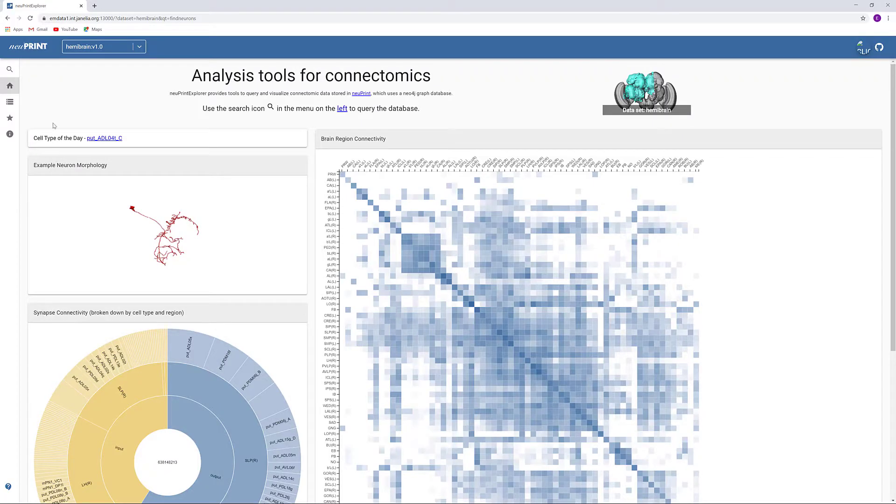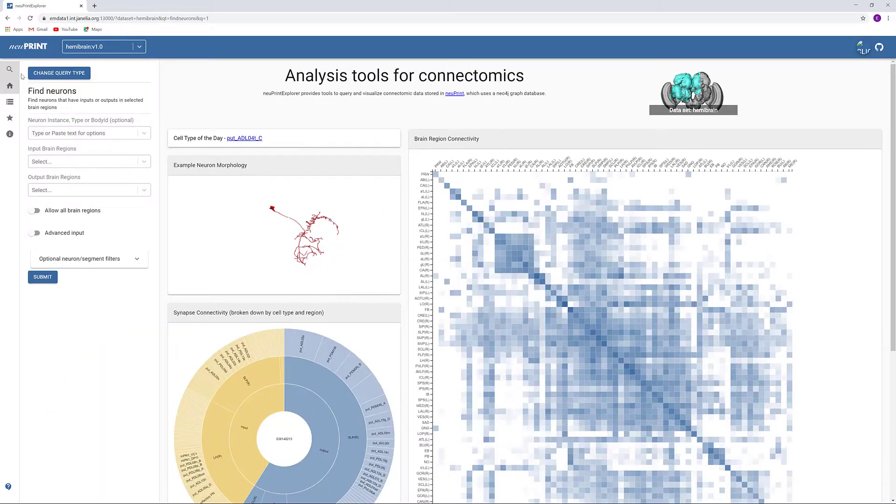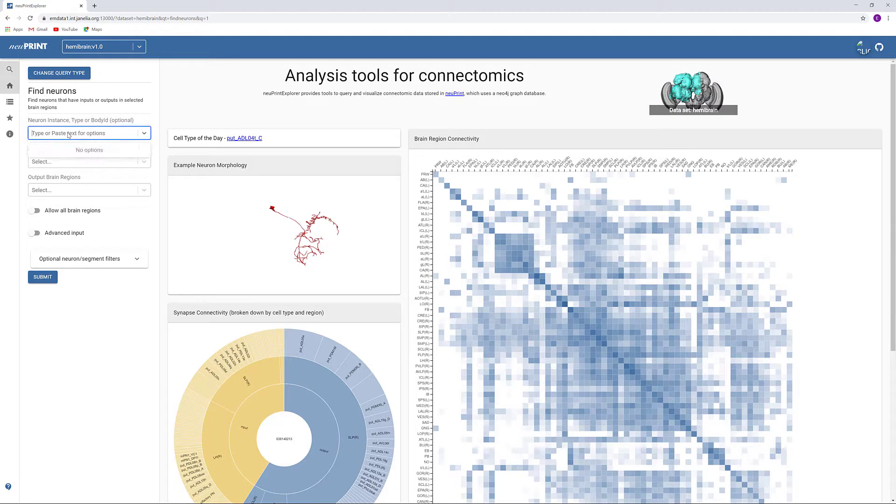This video will walk you through the tools for finding neurons you are interested in in NewPrint. We will be searching for the Gamma Kenyon cell type in this example.